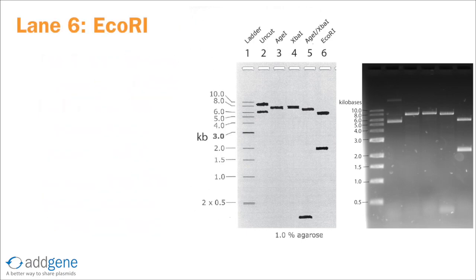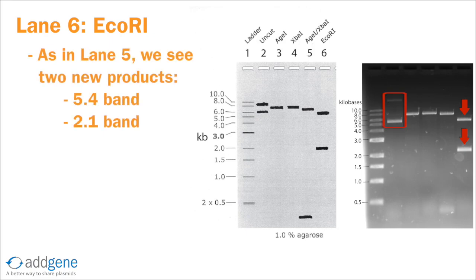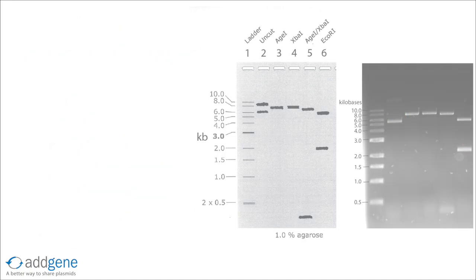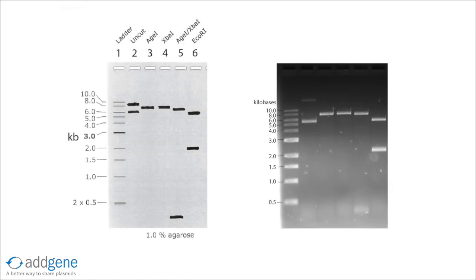Lane 6 is the EcoRI digest. Again, we see two new digestion products in this lane relative to the negative control lane. Notice we do not see any residual nicked or supercoiled bands, which indicates that the reaction was run to completion. Overall, our gel looks close to the expected results, and we don't see any bands that we can't explain. This indicates that the plasmid we've isolated is most likely the plasmid we think it is.